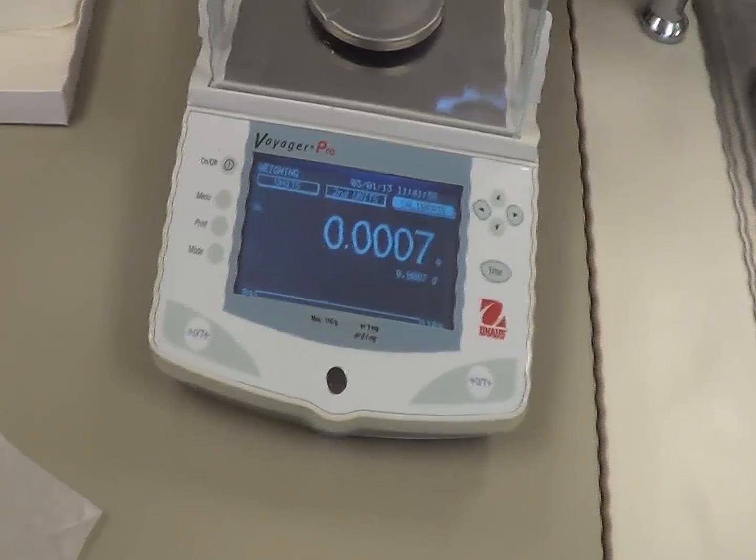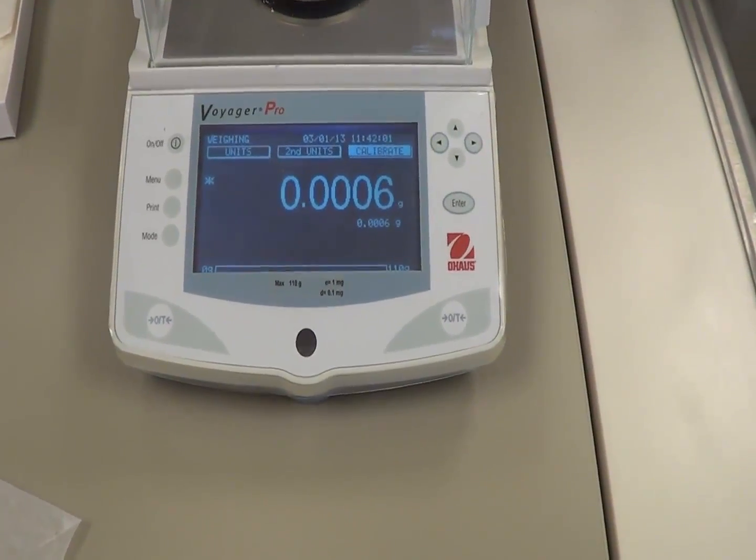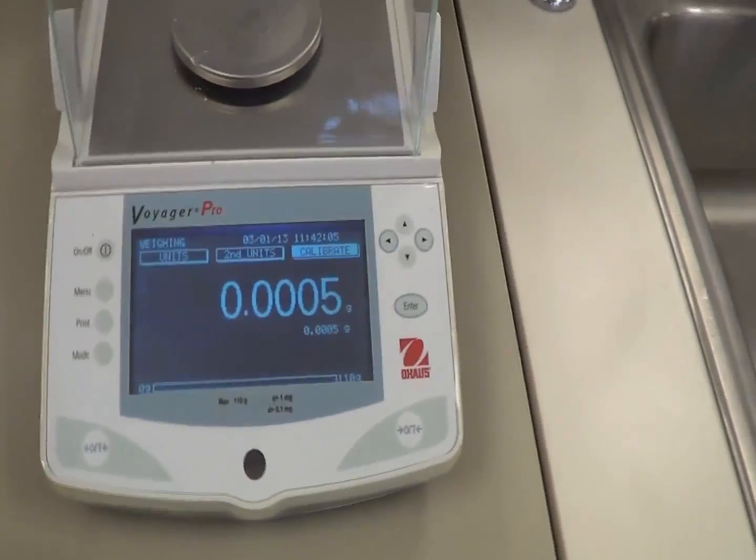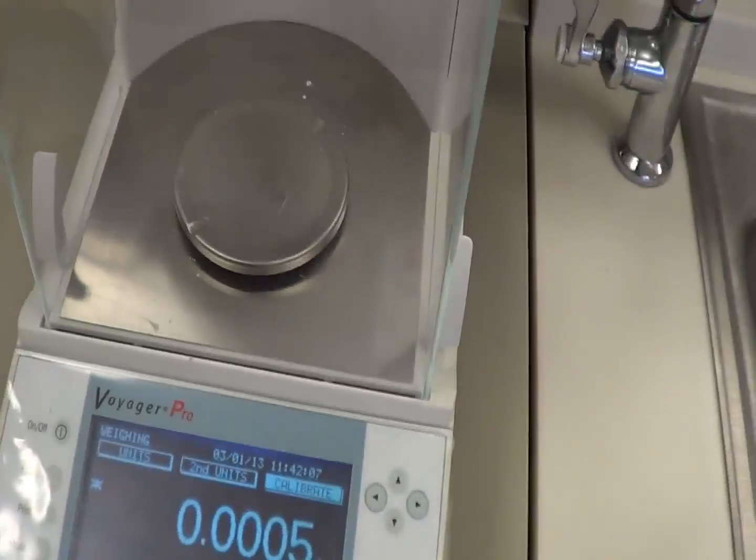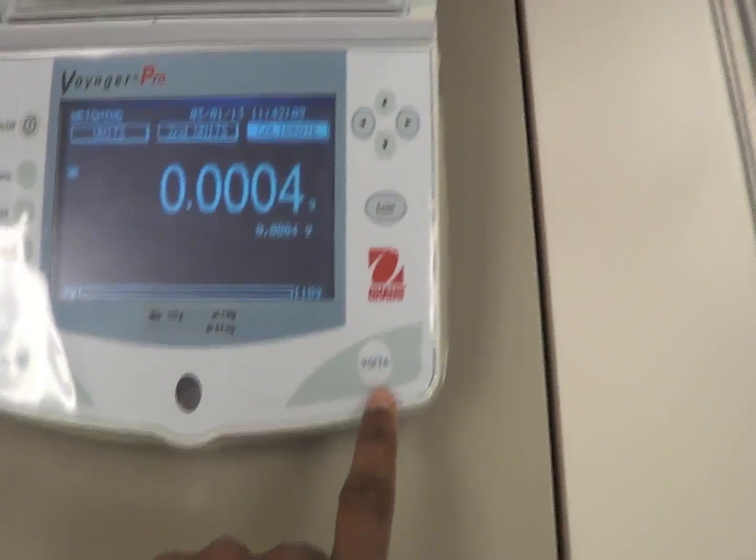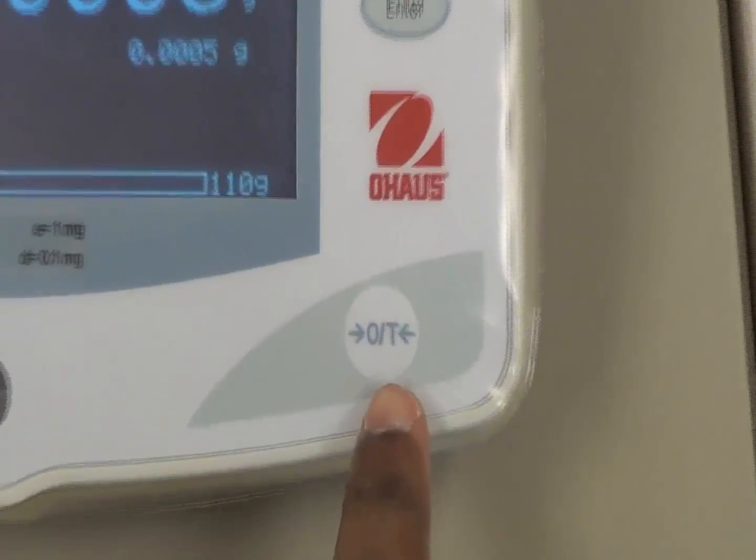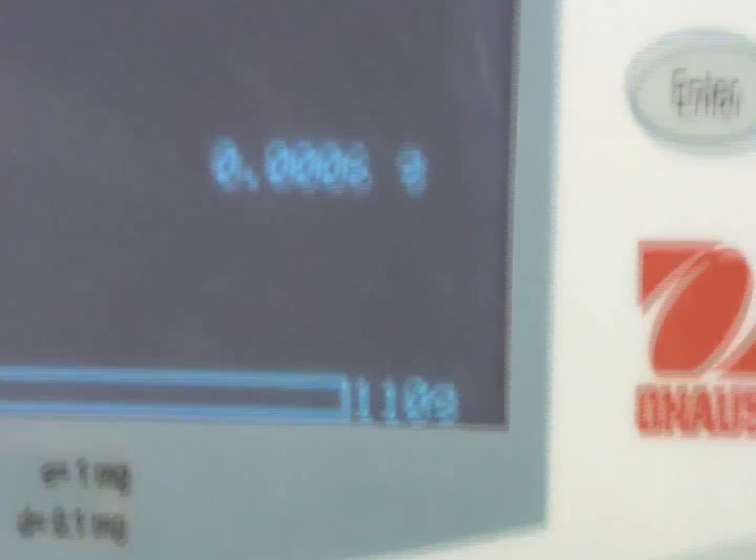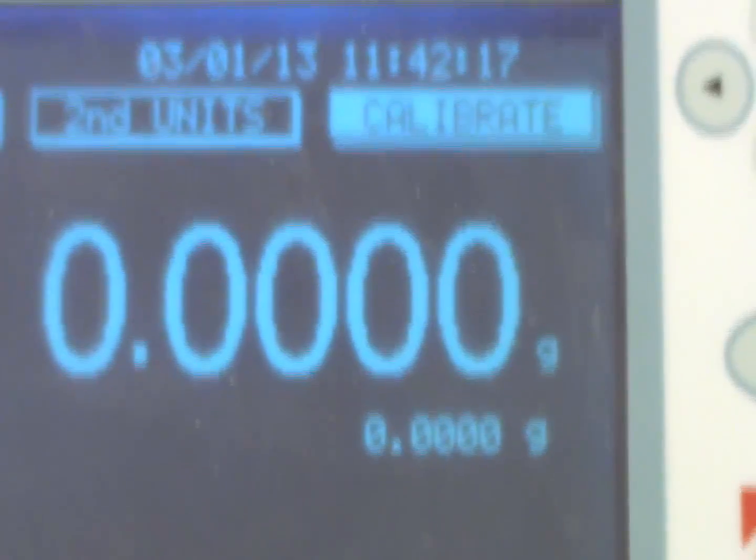For example, if you are weighing in milligrams, it is not at all good for you because you will be calculating an incorrect amount. And make sure each time you weigh, you press the zero. This zero here, so make sure you zero it. For example now, I press the zero, so I zeroed it.